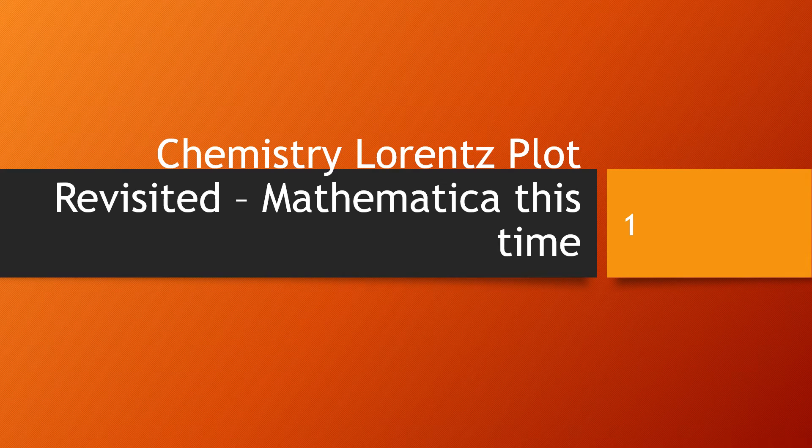In this presentation we are going to look at some chemistry peak data and fit it to a Lorentzian, and we're going to do this in Mathematica.